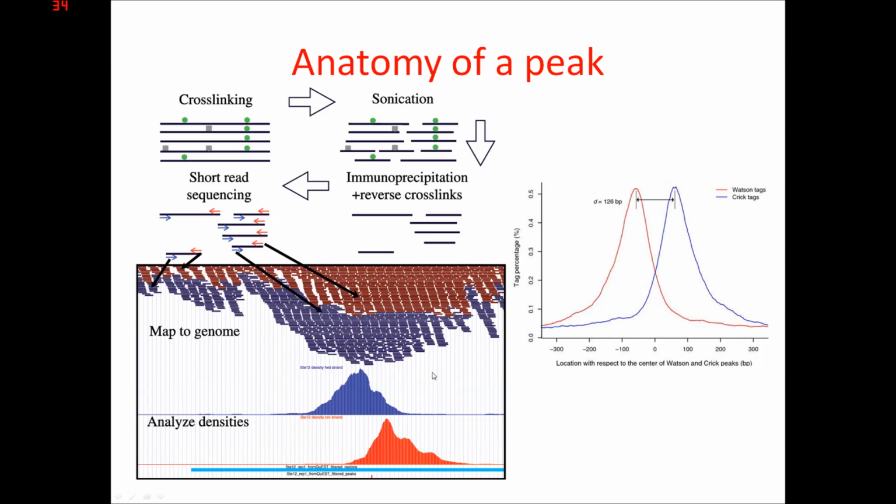Now what MACS does then is it takes a non-redundant set of reads, so only what I just said, up to 2 reads in each position on each strand. It throws all the other duplicates away and just uses the non-redundant set in the analysis. Sorry, you may want to go through and listen to that a couple of times because it's not terribly simple.